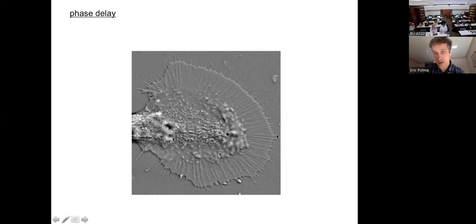And so this is a simple but yet an extremely powerful approach to learn about your sample. What it does not do, of course, is to tell you what molecules are in there and where they are. Okay, and that's because all molecules contribute to this effect. It's a general effect and not really molecular specific. And so that's where it stops.